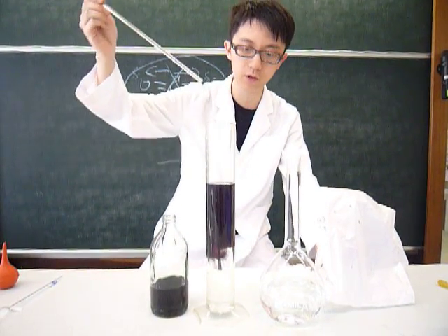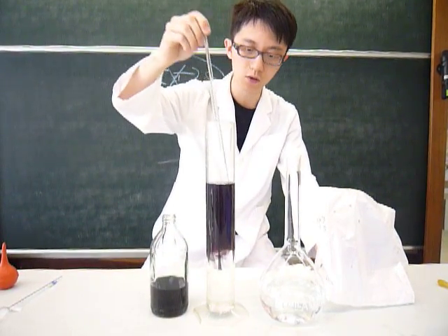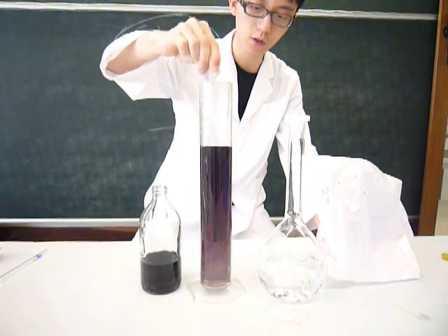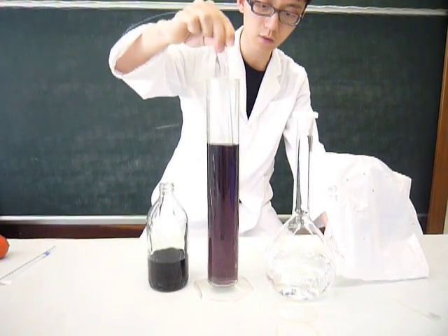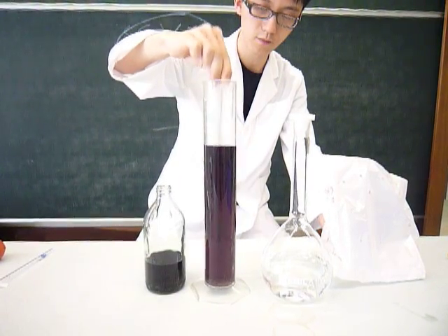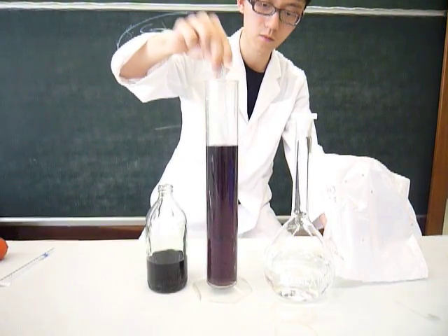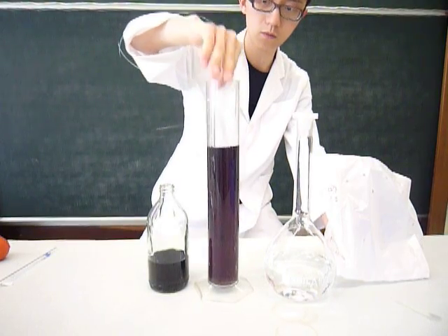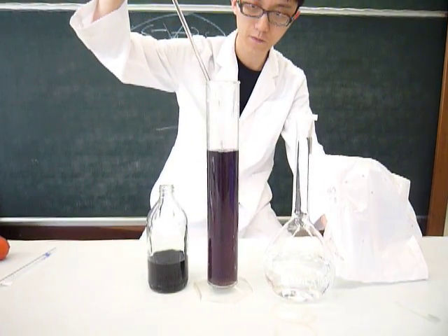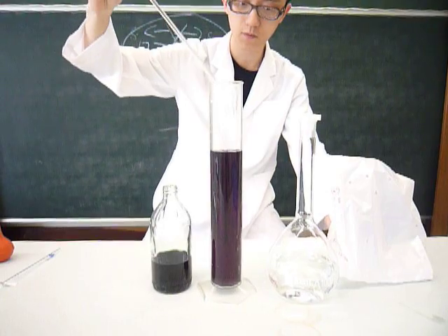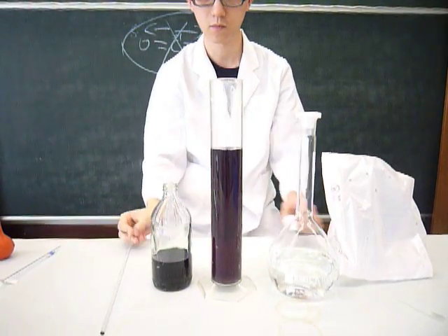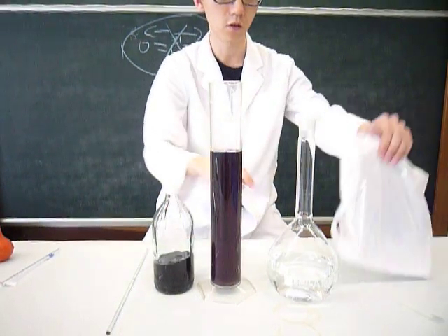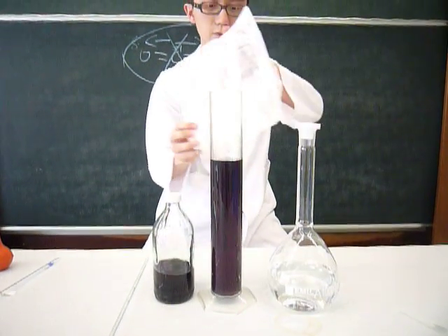We use a gas rod to make sure that it is full of the pH indicators. And then we put some dry ice there.